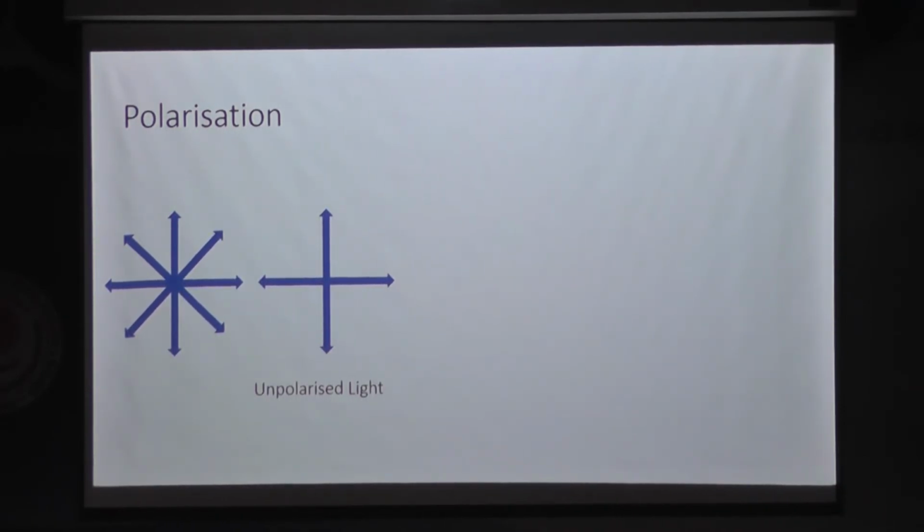What is polarization? Many of us are normally using sunglasses with polarization. That is the same mechanism. We normally say polarized light glasses are good for eyes. In a similar fashion we are using this polarization contrast in the microscope also. And what we are doing here is, we are just considering light propagating in one single plane for the contrast creation.